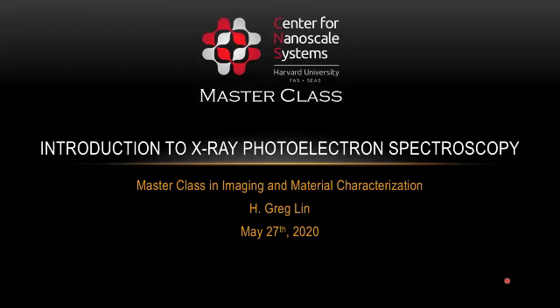Today, we'll be focusing on X-ray Photoemission Spectroscopy, also known as XPS. I'll first go into a brief introduction about XPS. Then I'll go into some detail about its instrumentation, XPS spectral data analysis, and a few applications. The goal of this seminar is to give you a clear idea of how XPS works and understand what it can do and what it cannot do.